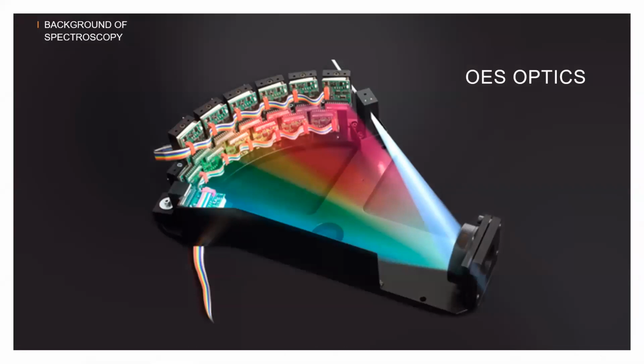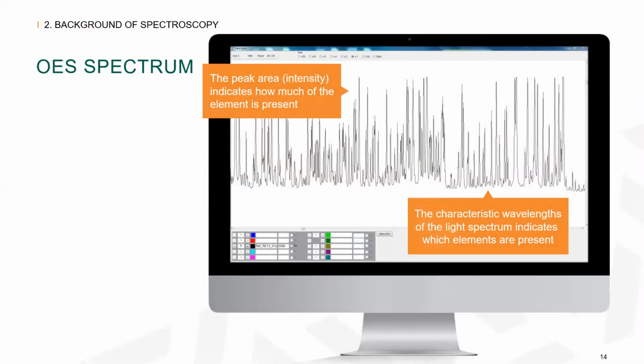Here we have the internal optical system. The light feeds into a slit in the upper right-hand corner. From there, the light hits a grating that refracts or splits the light onto CCDs or charge-coupled devices, with each detector covering a certain range on the spectrum dependent on the wavelength of the light that hits it. Intensities measured from the CCDs are then relayed onto a readout system in the computer to generate a spectrum.